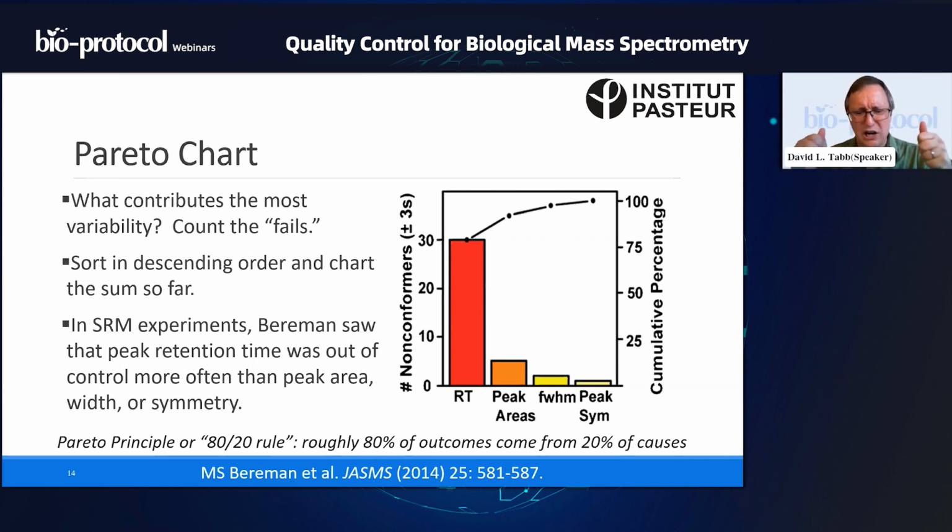But those bounds are really hard to find. You might say, what is the area of the whole thing? You could do that, but the peak area is a different factor. If you're trying to ask, how wide is it? The most common way that people do this is they ask, how tall does it get at the maximum? Then they pick a value that's half that height and ask, where does the peak cross upward through that line and downward through that line? That width is called the full width at half maximum. So sometimes they were rejecting peaks on that basis.